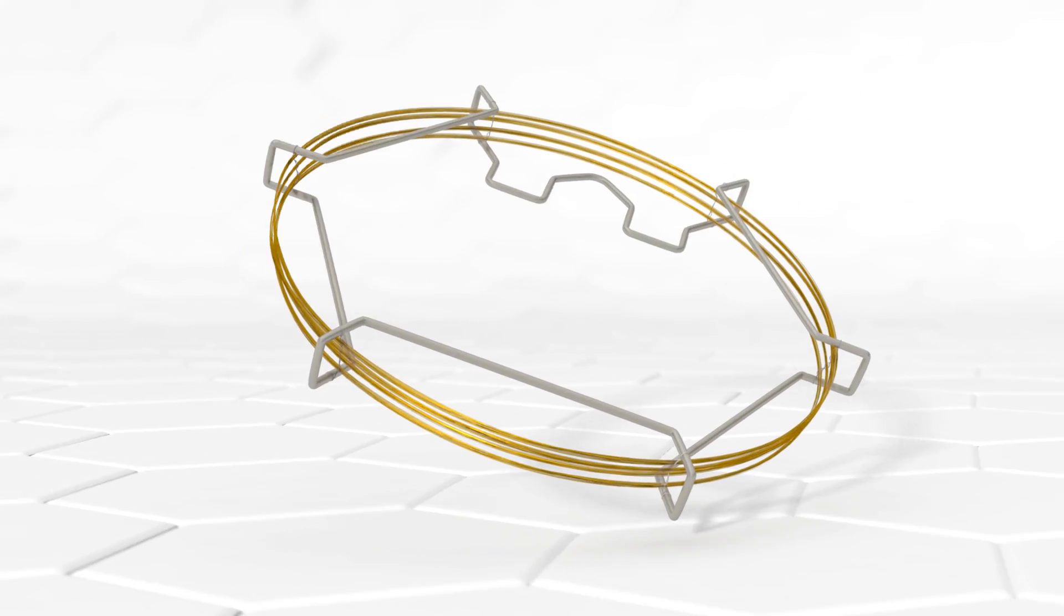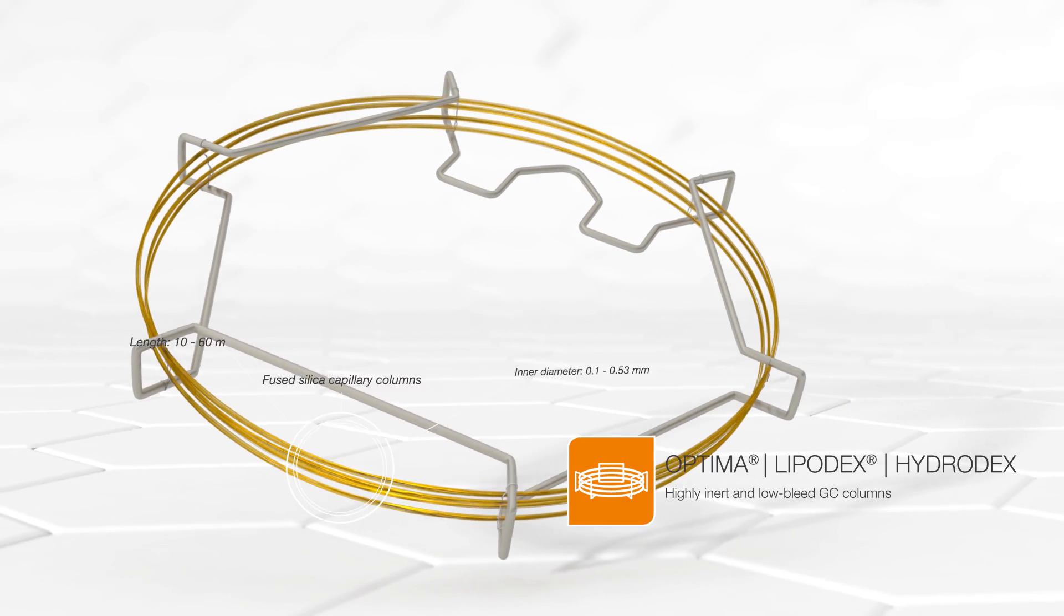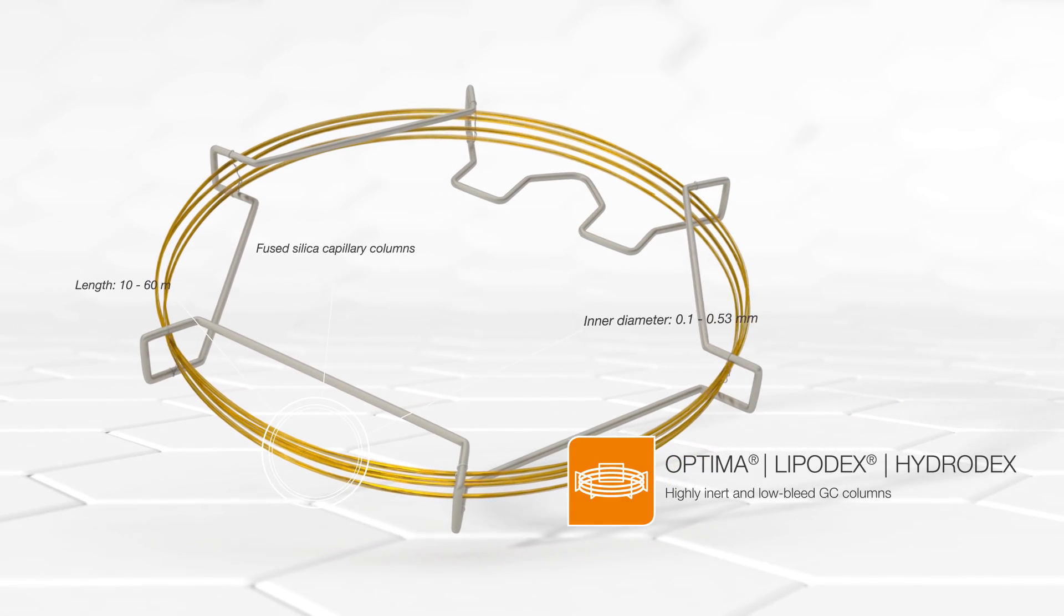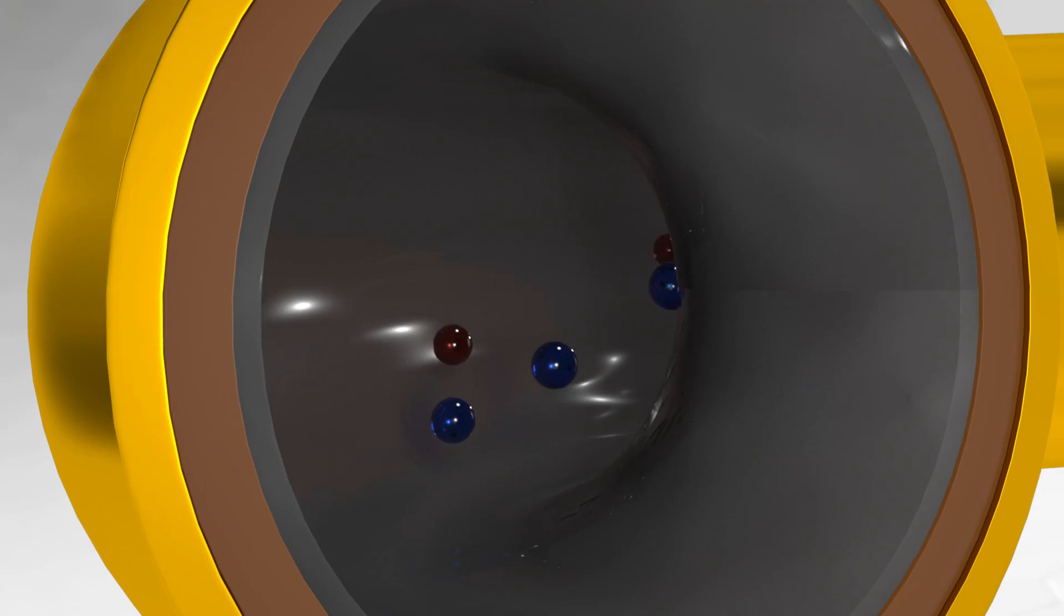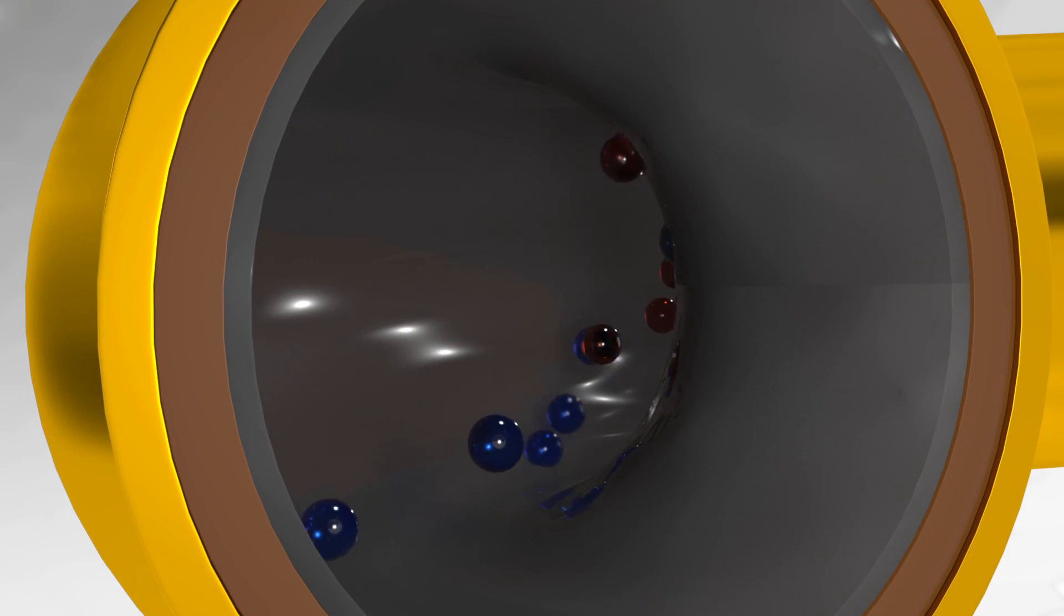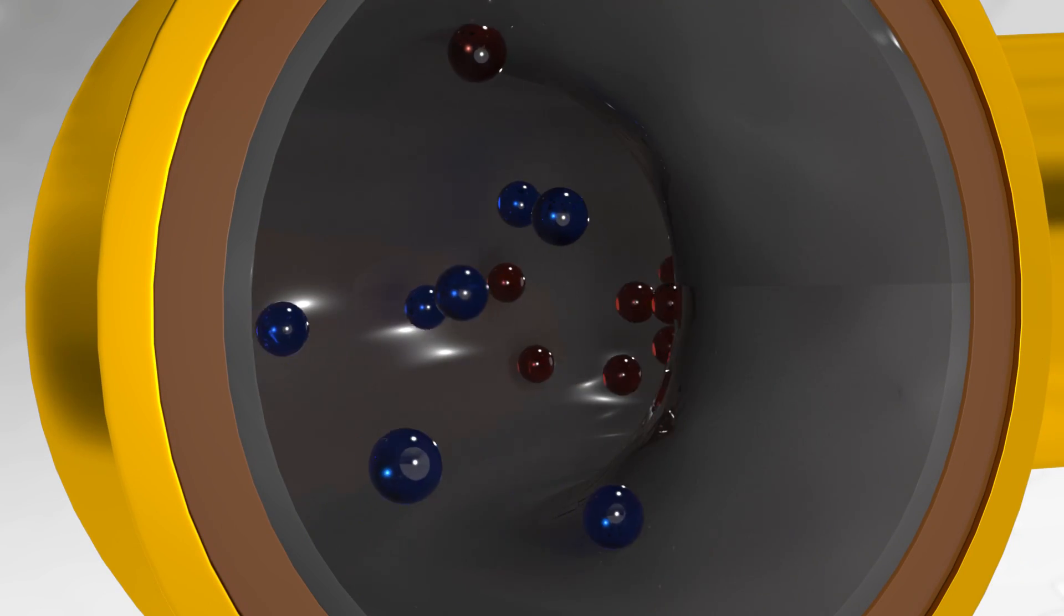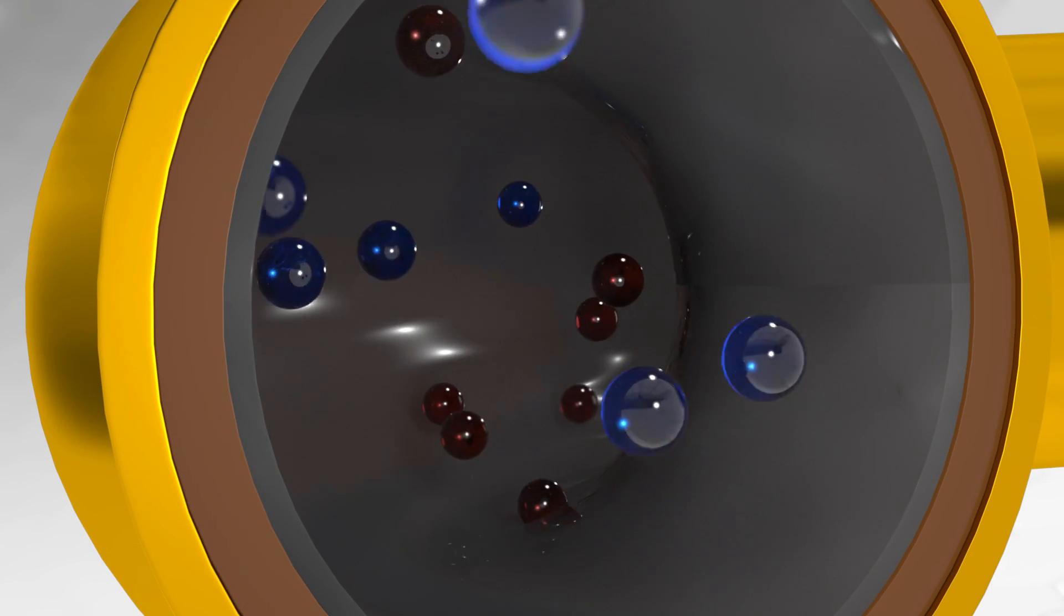With more than 50 stationary phases, our range of highly inert and low-bleed GC columns allows you to get accurate and reproducible results.